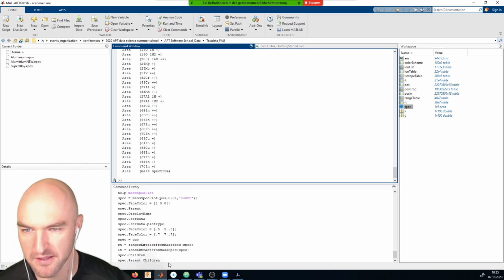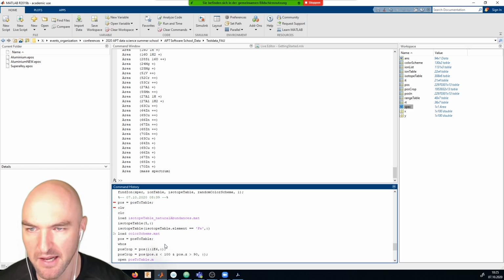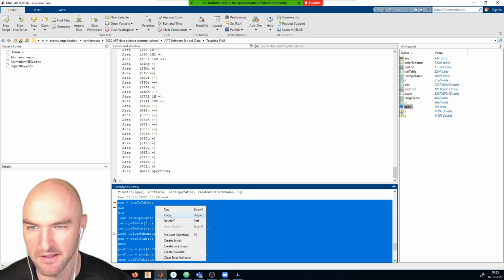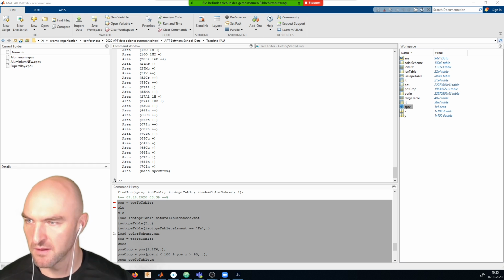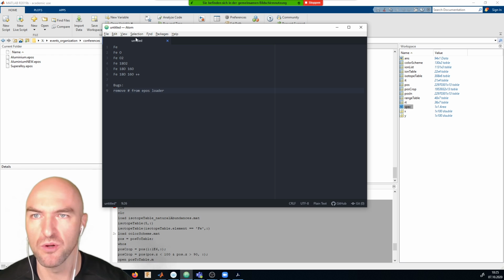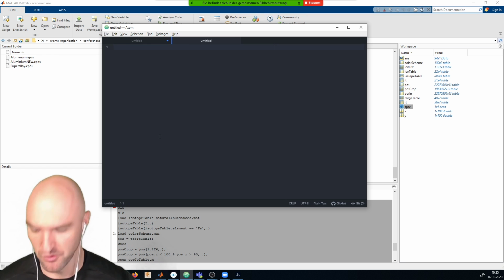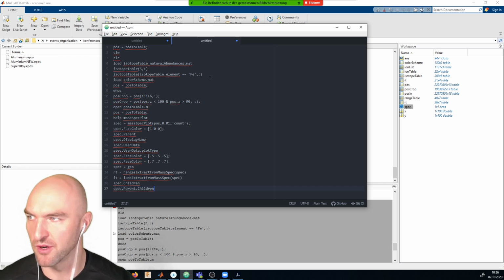So what we can do is I will just maybe take everything that I've done right now and copy that into the group chat, and I will also open a new file here, and we'll give you all of that code later on via email as well.